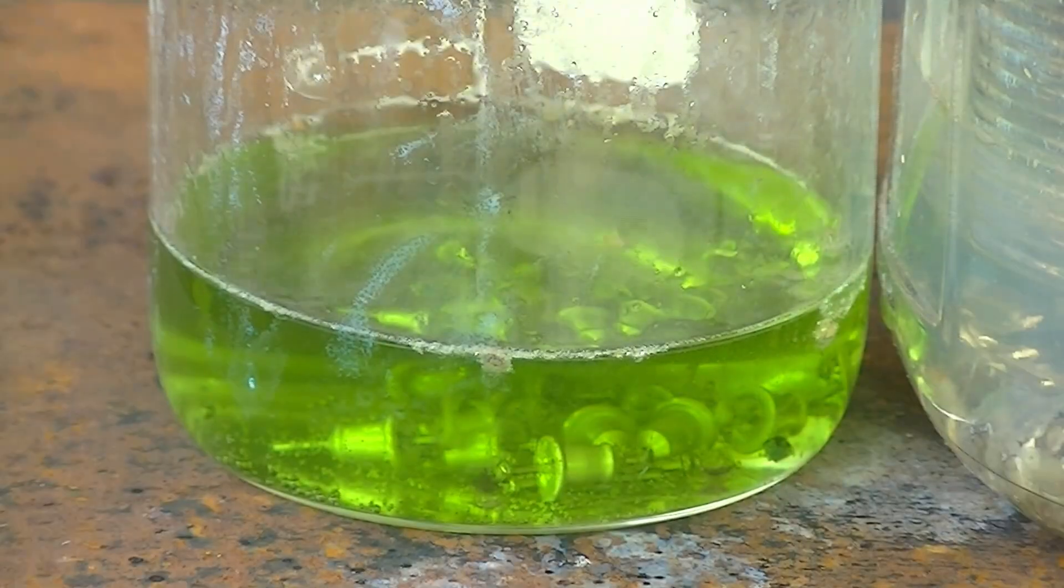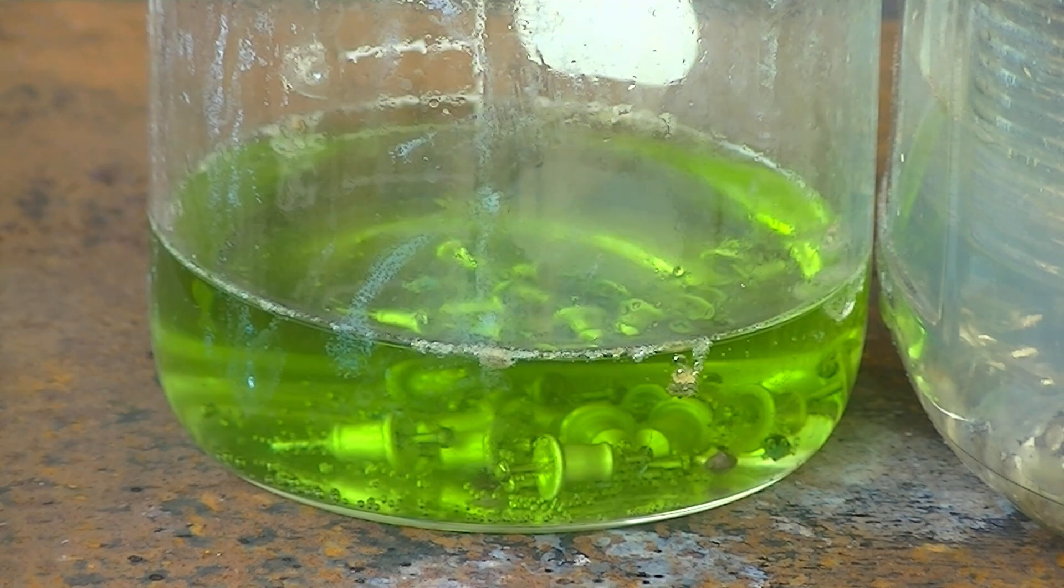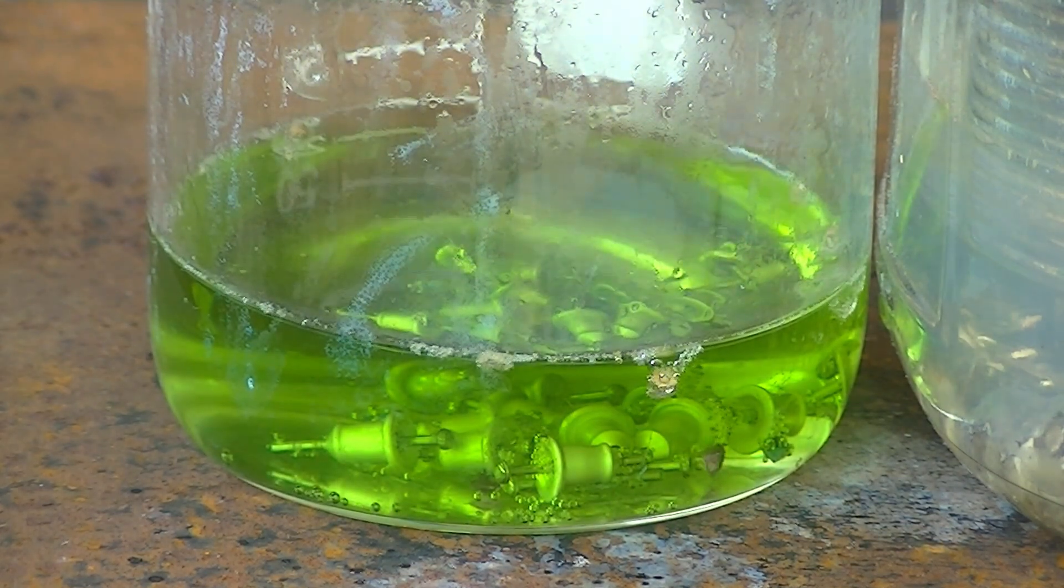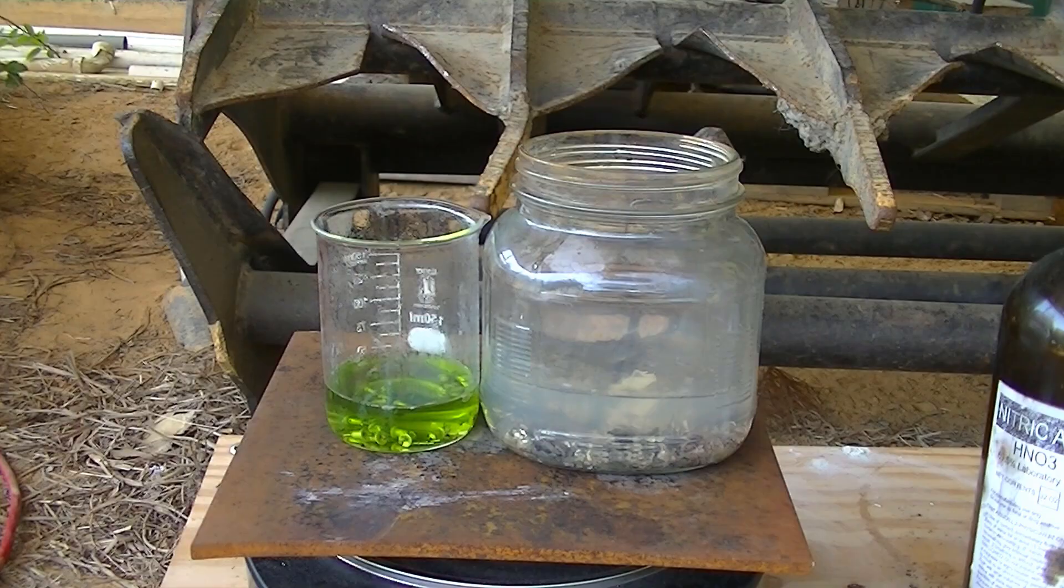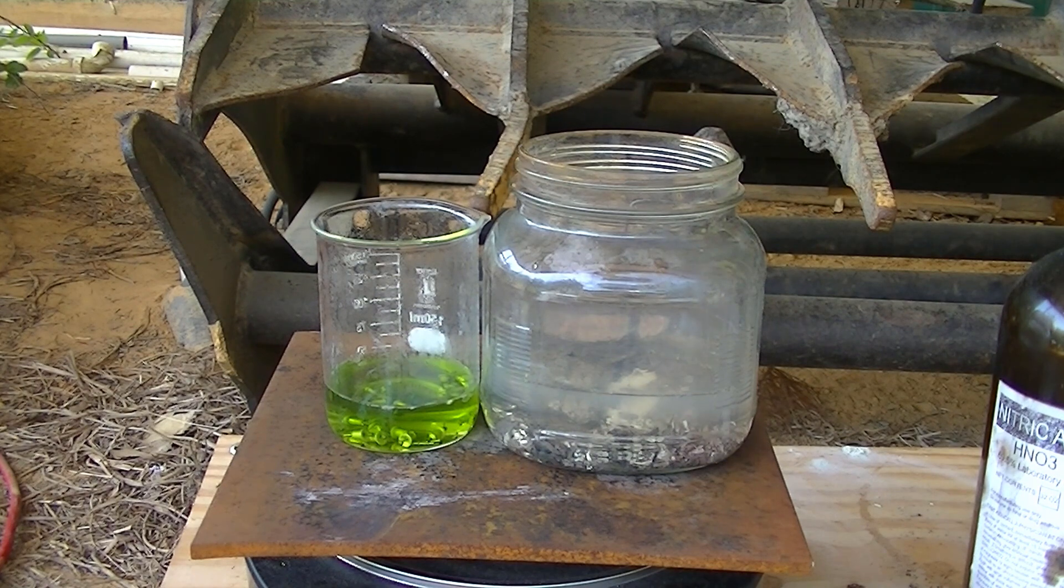I separated out these earrings because of the diamonds and also because they were attracted to a magnet, so I knew that they were not made out of silver. From the green color that this acid turns though, I can conclude that these were actually made out of nickel and not the steel I originally thought.